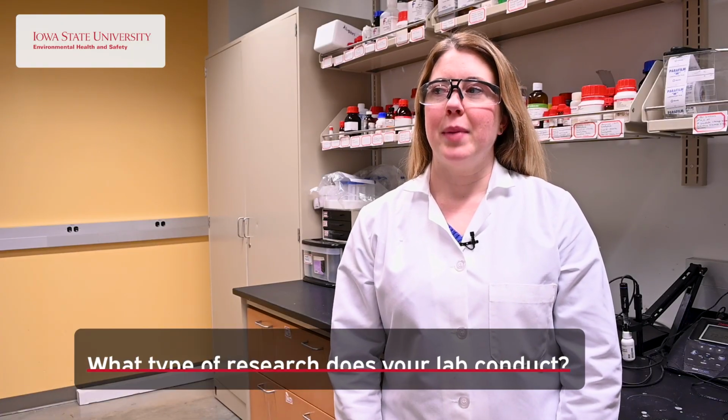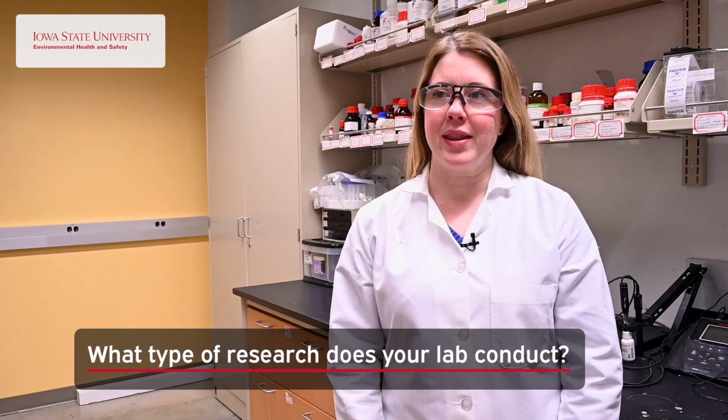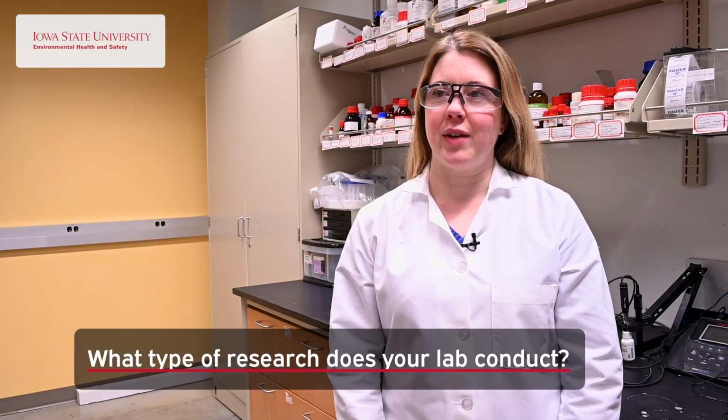My name is Robbyn Anand, and I'm an associate professor of chemistry here at Iowa State University. My lab does research in bioanalytical methods. We develop diagnostic devices and techniques, as well as separation methods for sample preparation.